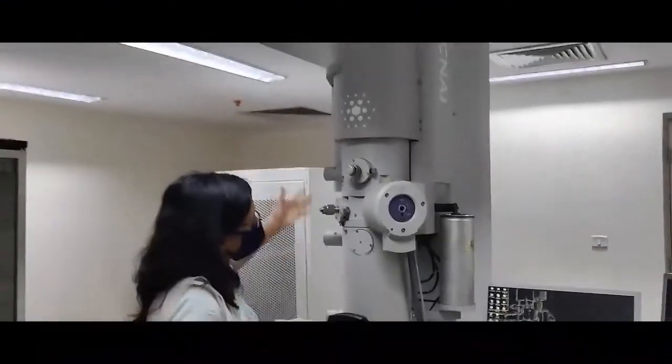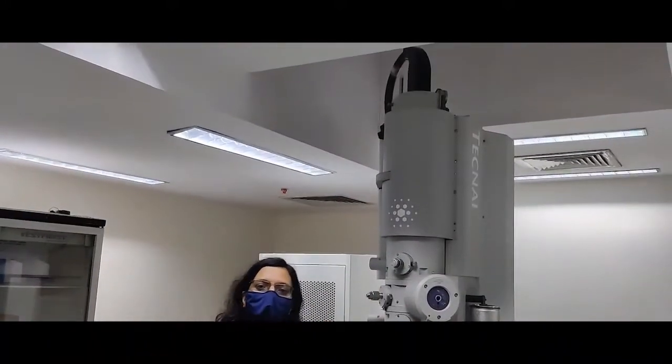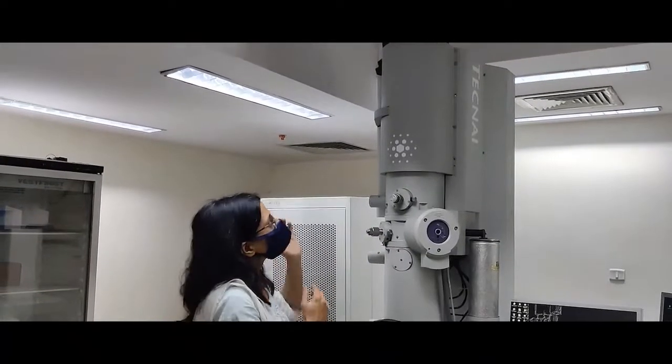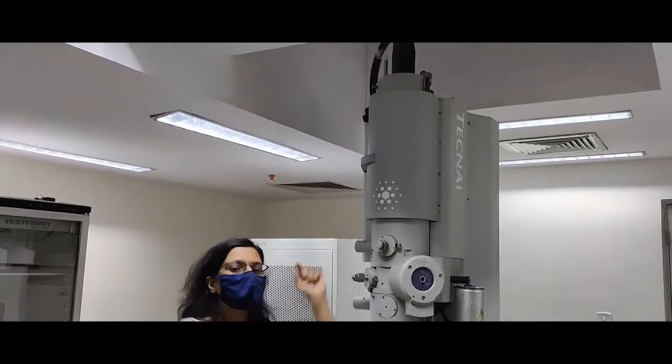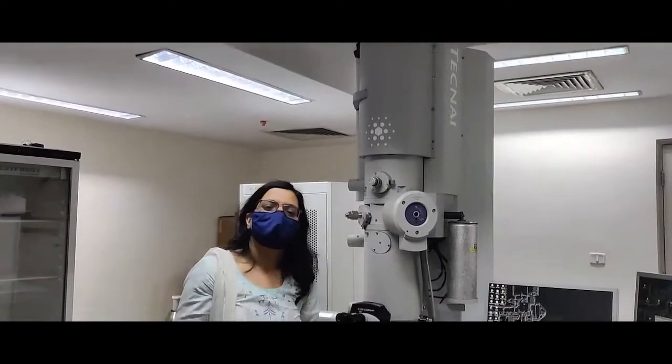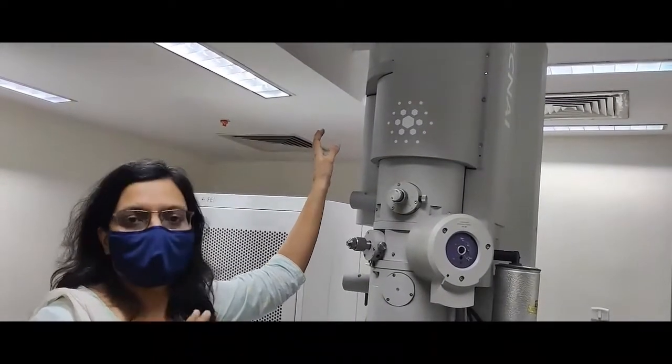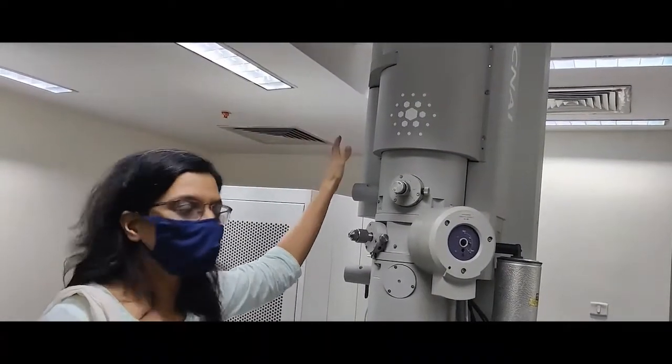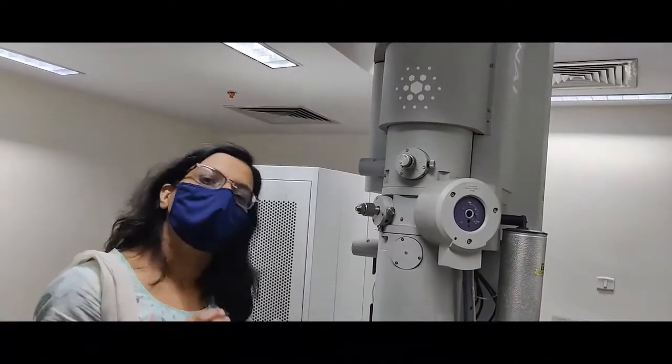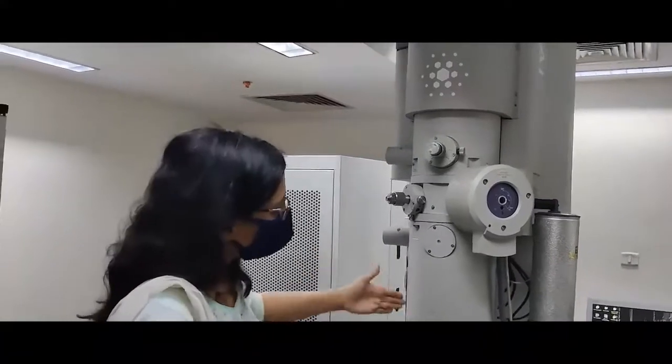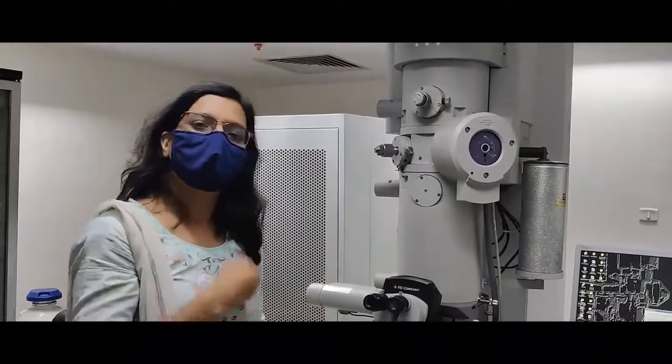So, this is the long column that you see, and at the top of it, just like in compound microscope, you have light as the source of illumination. Here, the electrons are the source of illumination, and they are at the very top. So, there is a source which emits electrons. The column is very, very special in the sense, it has no air. It is a high vacuum column, because otherwise the energy of the electrons will get dissipated. Electrons travel best in vacuum. So this is a long column because it needs a long time, or a travel time to get accelerated.